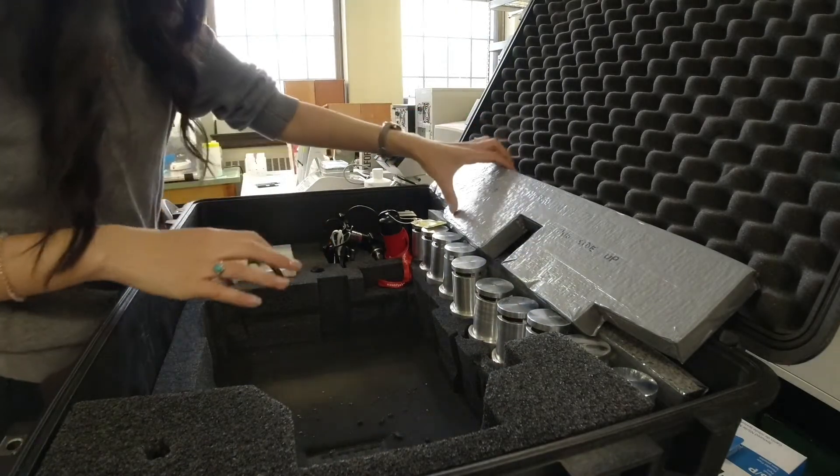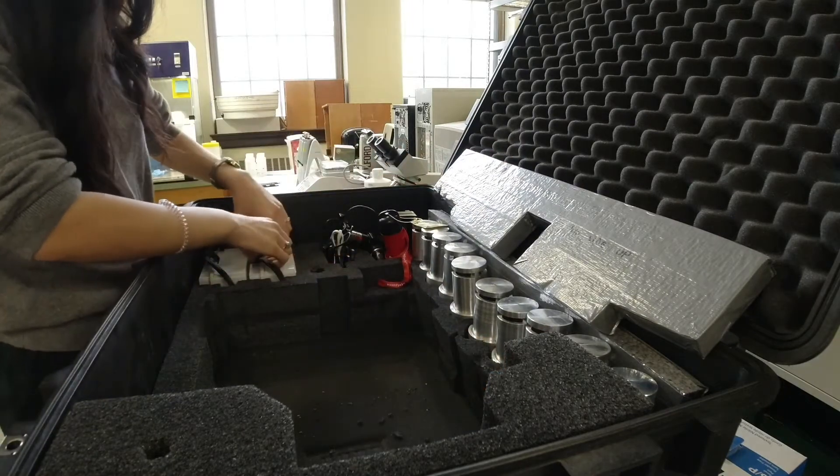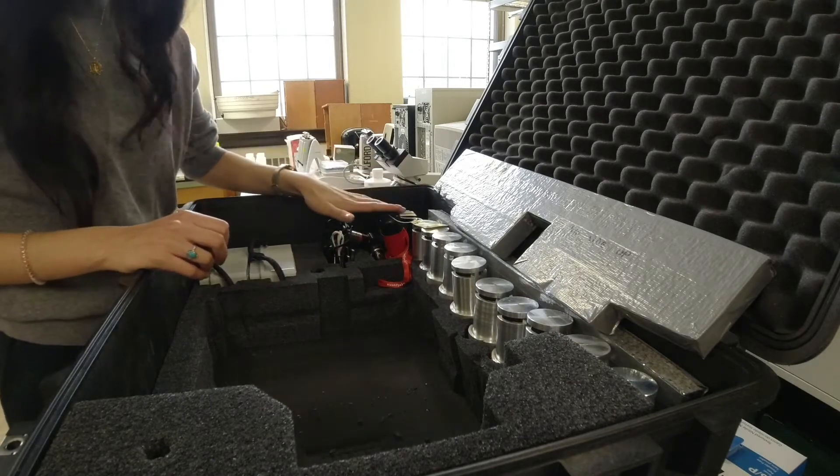Now you can see all the different pieces a little more clearly. These are the filter housings over here, the batteries, the chargers for the batteries, the telescopic scope, and the depth finder.